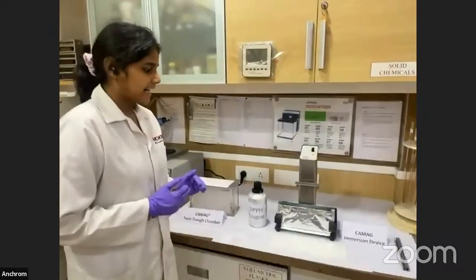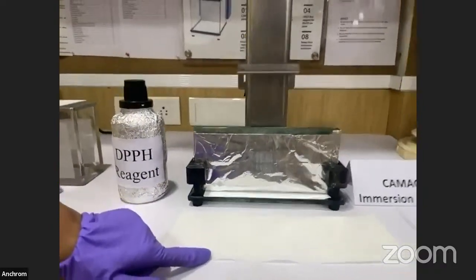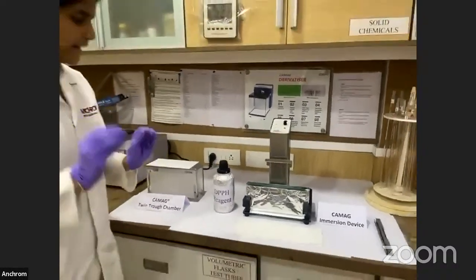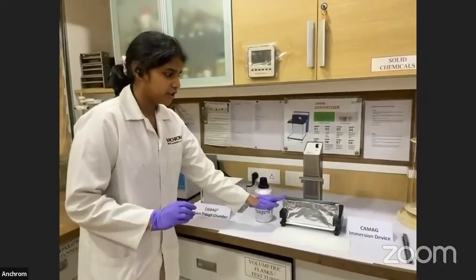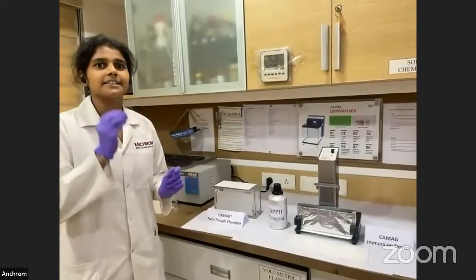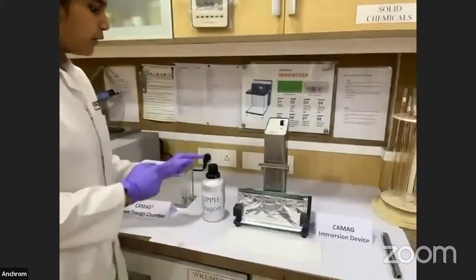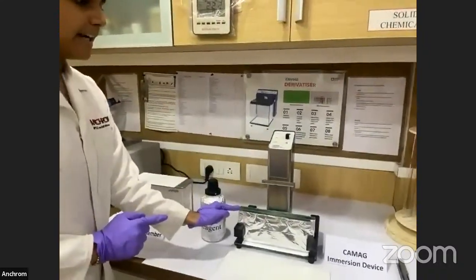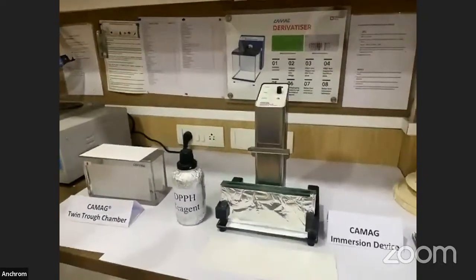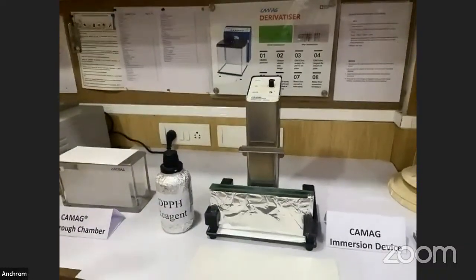So to perform DPPH activity, we will require DPPH reagent and the CAMAG immersion device. Before performing DPPH activity, we have to ensure that the dipping chamber is covered with aluminum foil as DPPH reagent is light sensitive. So now we'll pour this DPPH reagent in the dipping tank. Before pouring the DPPH reagent into the dipping tank, please ensure that lights are off.